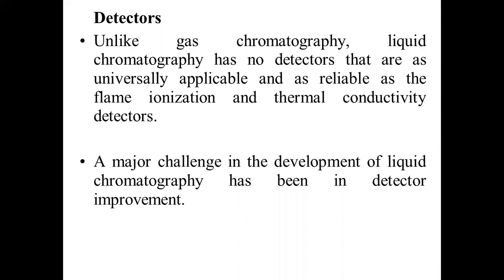In order to get these two pieces of information, detectors are required. As we have discussed under gas chromatography, detectors are also very useful in chromatographic techniques for either identification of the solute or quantification of the solute. Both roles are played primarily by the detectors. Of course, the column is going to be the heart of the chromatograph.